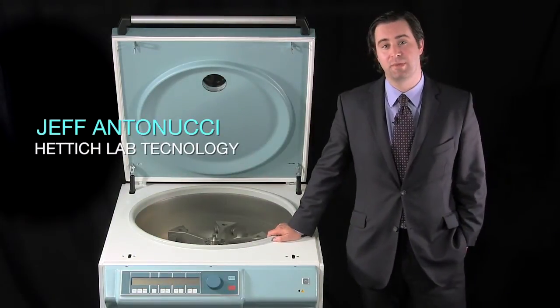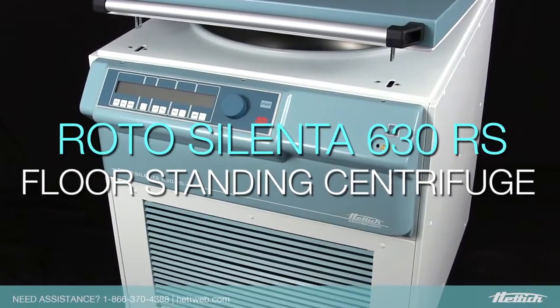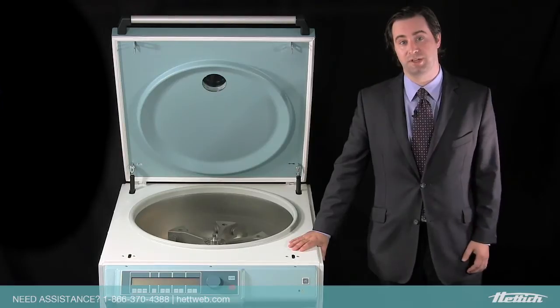Hi, I'm Jeff Vance Nucci from Hettich Lab Technology, here to introduce the Roto Silenta 630RS floor standing centrifuge, specially designed for both clinical and research applications.